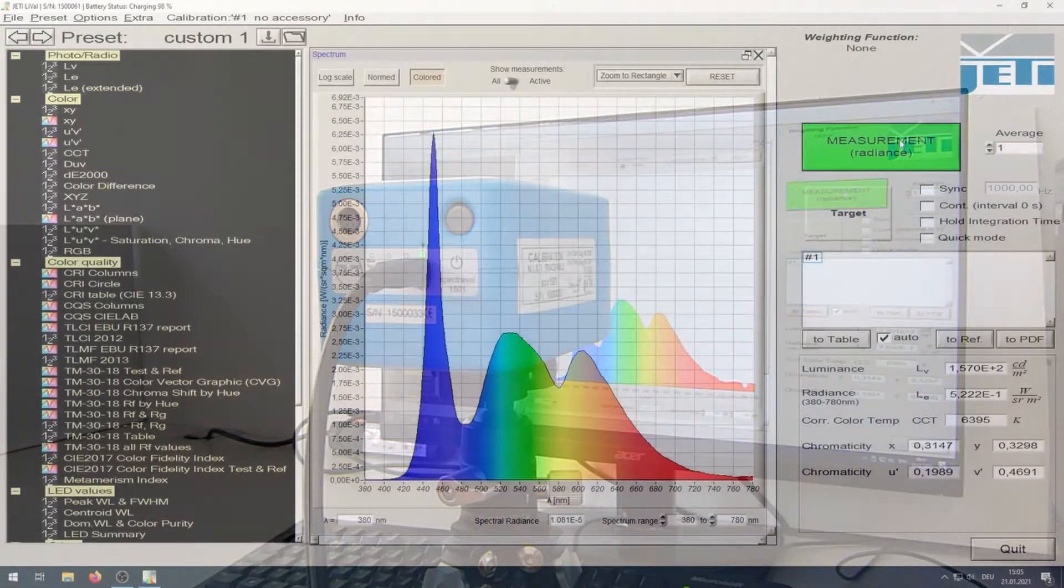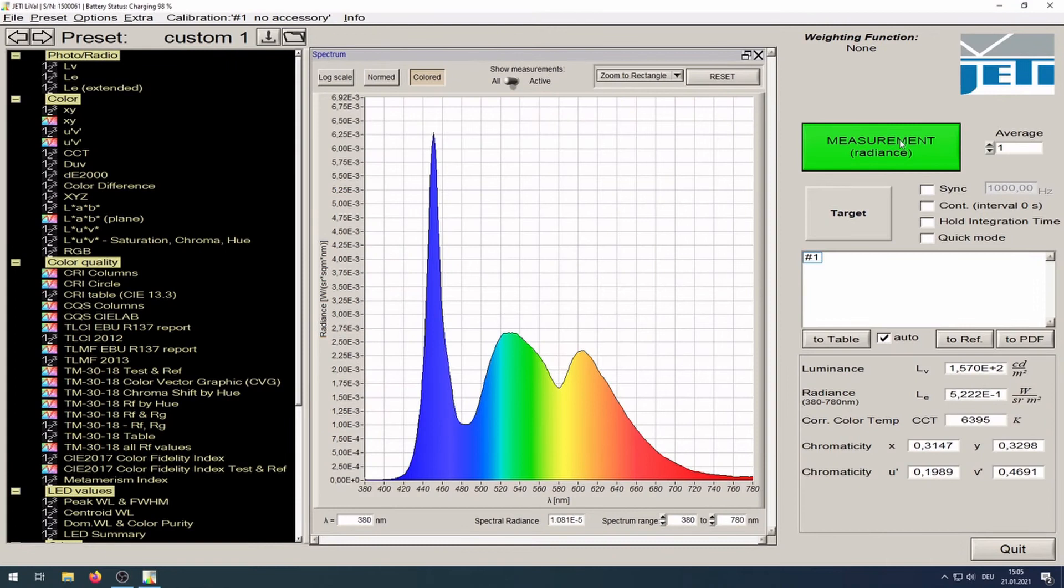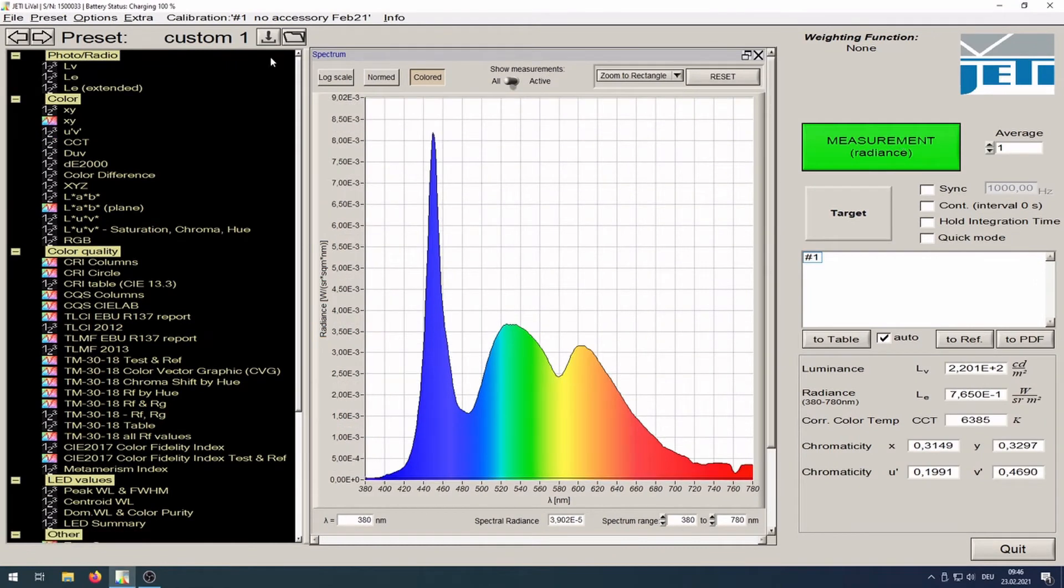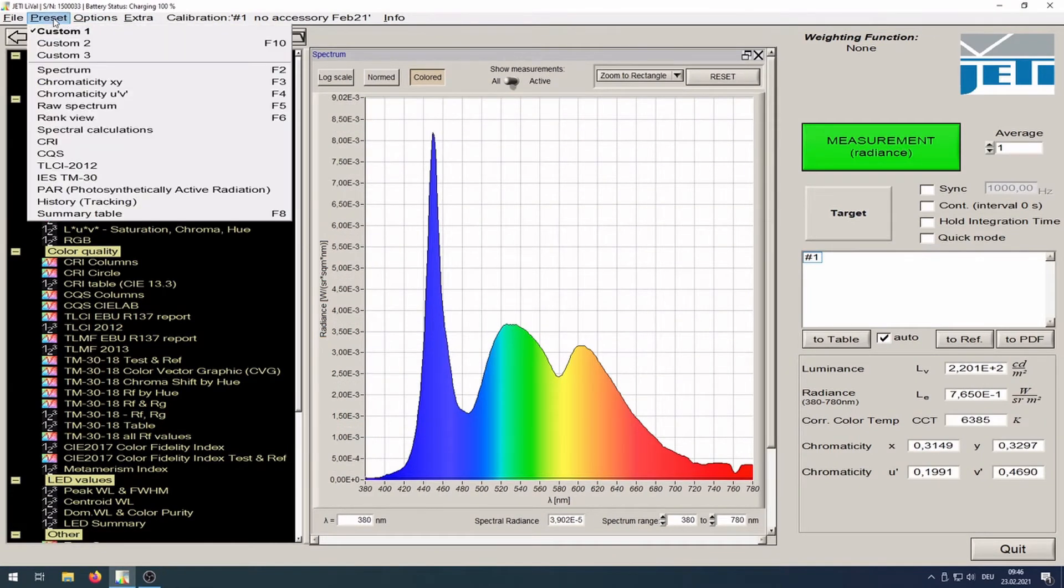Spectrum and measuring values will be shown. For other measuring values, click preset and choose between custom 1 to 3.